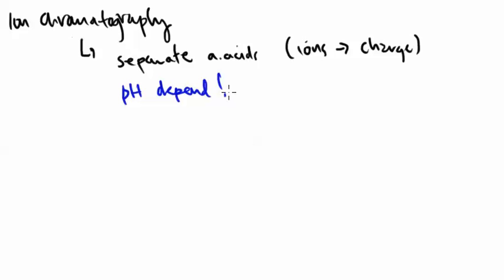So it's not uncommon to see some type of buffer solution being used, and we've spoken about buffers. If you're uncomfortable with buffers, go back to that general chemistry text or go back to our YouTube videos where we talked about acid and base chemistry in Organic Chemistry 1, and you will see a couple of videos there concerning buffers and buffer solutions. So we typically make a buffer and we put it on this machine and we help control the pH. That's the purpose of the buffer.